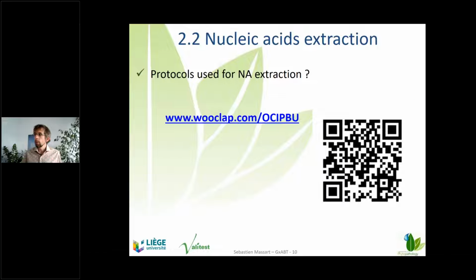We can go to the poll, but I think I have already put it. We see the survey. We have a second survey which is possible to carry on here. So I put it here for you. The nucleic acid extraction and purification protocols are identical to the ones used for RT-PCR.